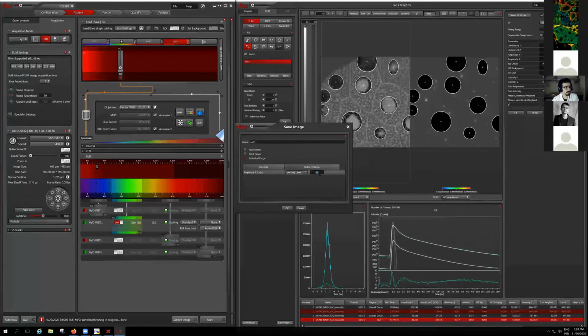So that's why I apply a factor or range of 0 to 0.001. It's actually divided by 1,000. I'm changing the values, so 1,000 times more. So that's how the gray value would look. It's interpreted as the amplitude, or for the lifetimes, when we have nanoseconds, that would be translated to picoseconds.